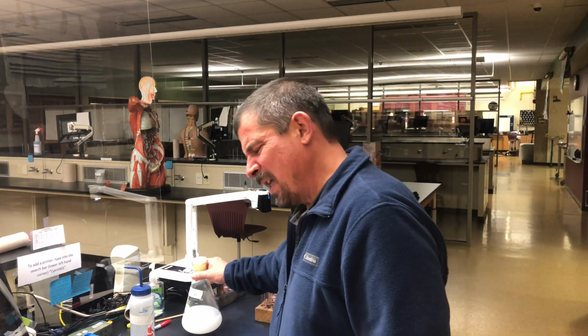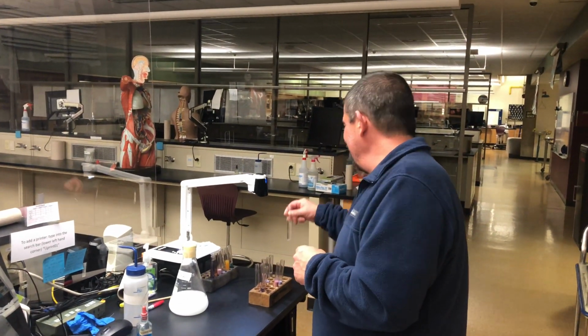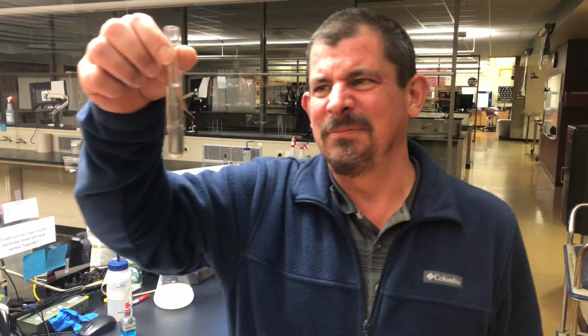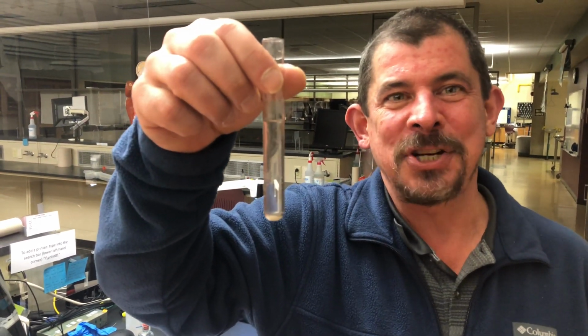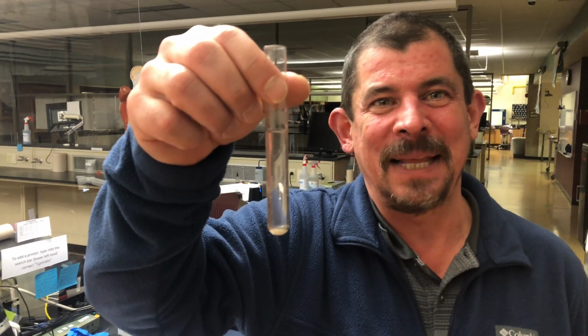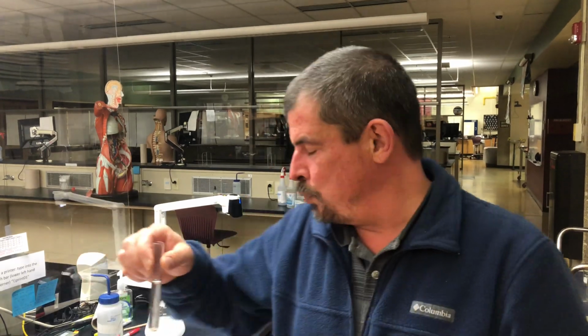Then again, we put that in the incubator for an hour and a half at 37 degrees and let it sit. After the hour and a half, we come back out and pull those test tubes out. In this case, what we end up seeing is right here. That's what we end up seeing no matter what, so we can't tell if digestion occurred or not. It's just going to be a plain, clear tube until we do a few things to it.